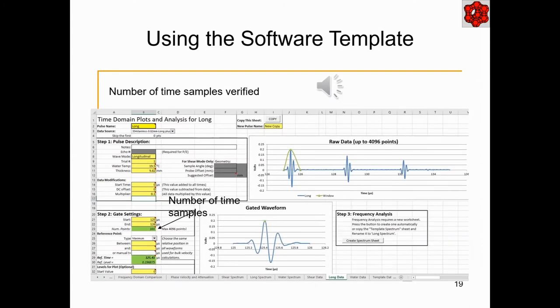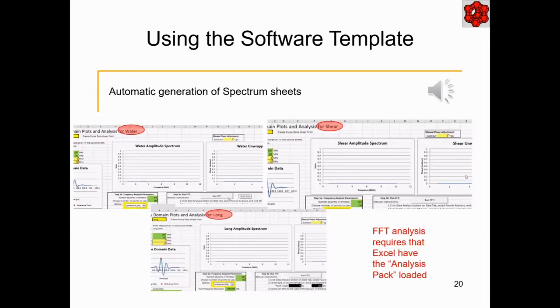In order for Excel to carry out the next step, the number of time samples in each gate must be identical. Ensure that all the gates are the same size, that is, the same number of data points along the time base. The worksheet for the FFT of each waveform is identified as the spectrum sheet. By clicking on Run FFT for each waveform, we then generate the fast Fourier transform of the signal. This can take several minutes and is probably the only downside of using Excel. The calculation of the FFT requires that you have the analysis packs from Excel loaded.